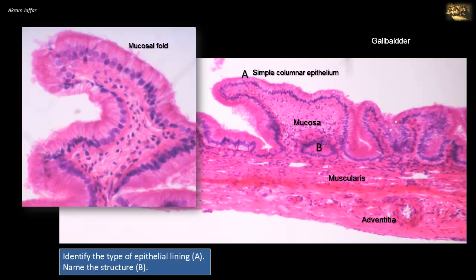Diverticuli, or crypts, form deep indentations in the mucosa, like the one shown in B. Sometimes deep crypts might extend through the muscularis externa as well, though this is not shown in this section. The presence of deep diverticuli is not considered abnormal by itself, but it can foretell some pathological changes. Bacteria might accumulate in these sinuses and cause chronic inflammation, which is a risk factor for formation of gallstones.